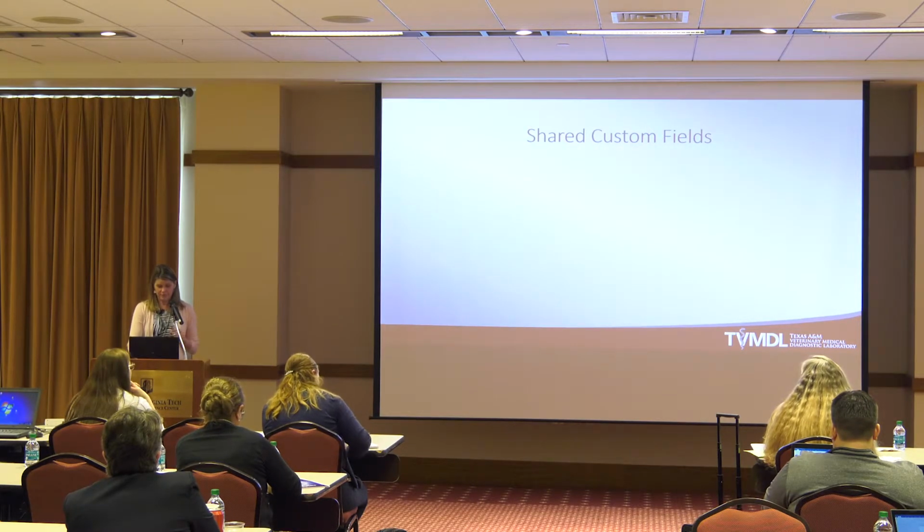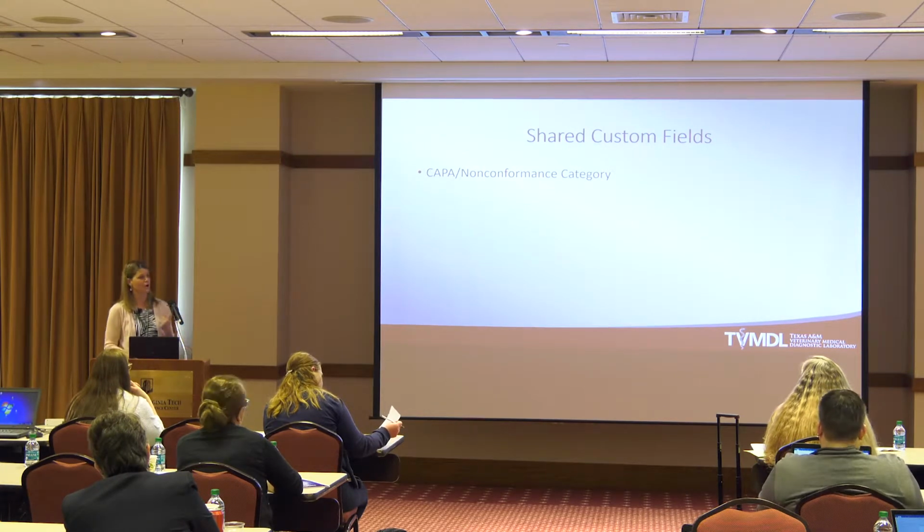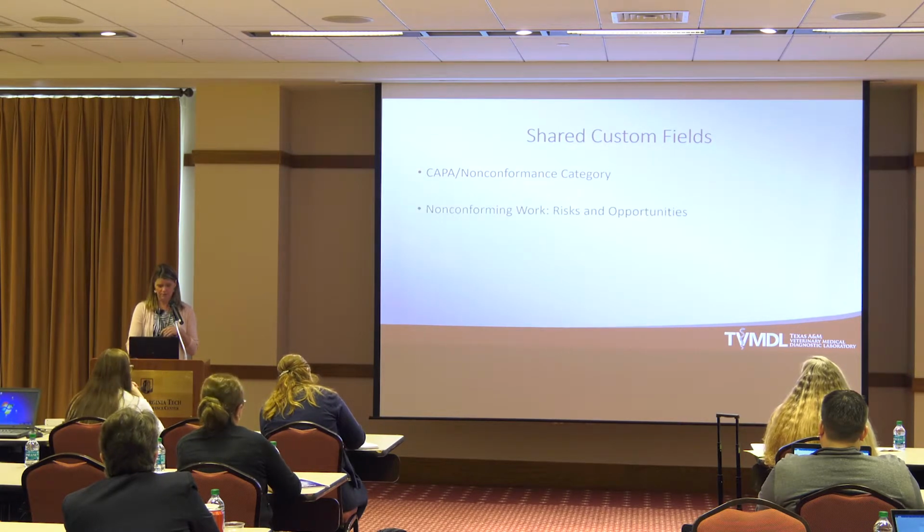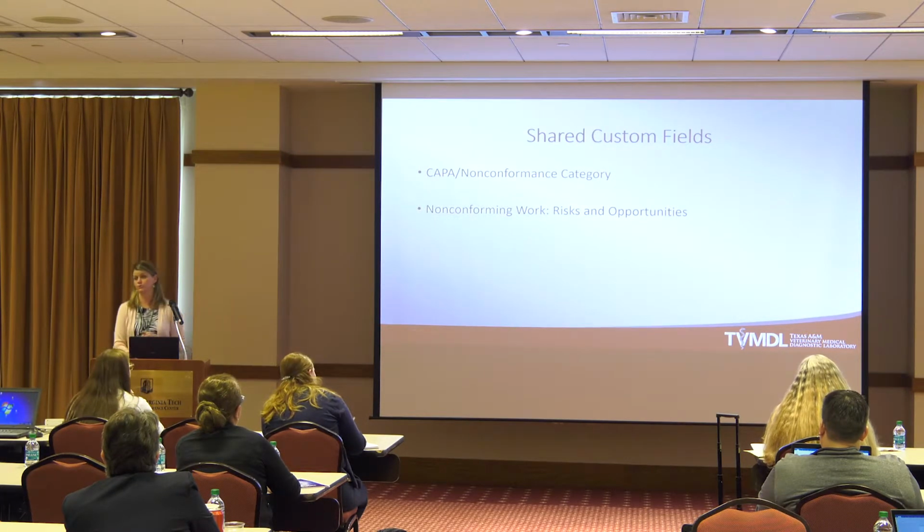So we have a couple of shared custom fields. CAPA nonconformance category, so that's what we call it, and we use it in multiple workflows. And then we also have the nonconforming work risks and opportunities. So we have that same custom field that we also use across multiple workflows.